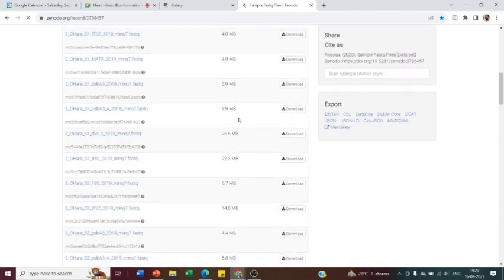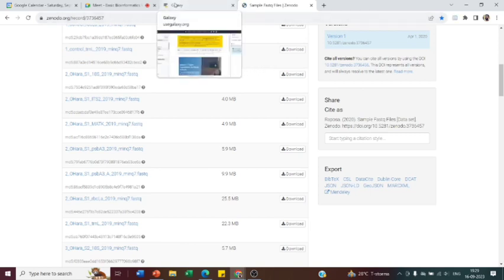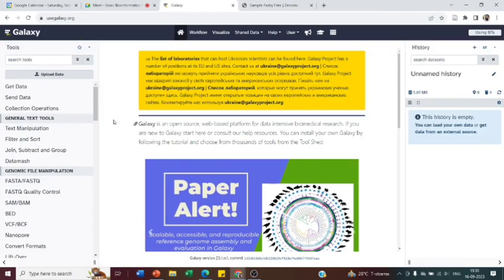They are MB files only. If you go to the GEO website in NCBI, you will get files, but all are very big, GB size. We can't process them properly. So, I have just taken a small file in order to show what is happening here. Just like BLAST, we will upload it and analyze it, that's all. That is what we are going to do.